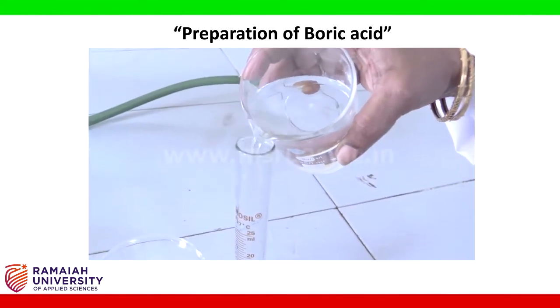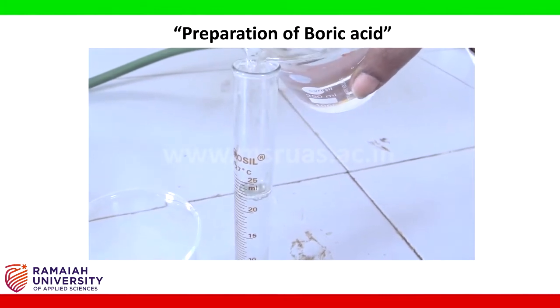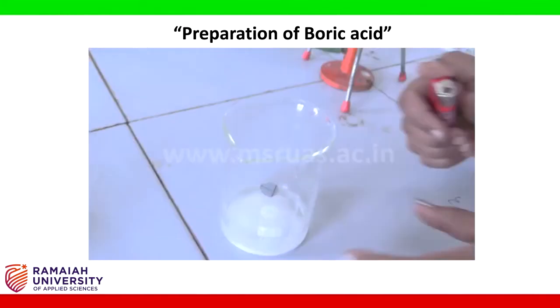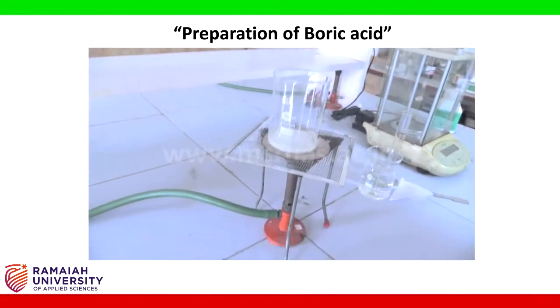Next step is to add about 20 to 25 ml of distilled water. Now we'll dissolve the borax under hot condition.